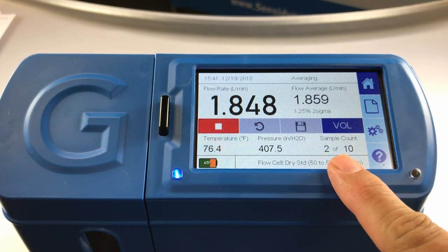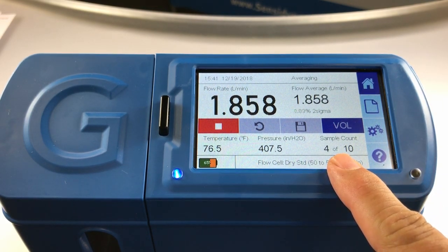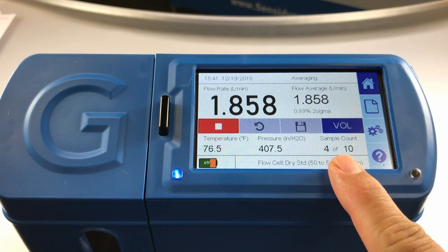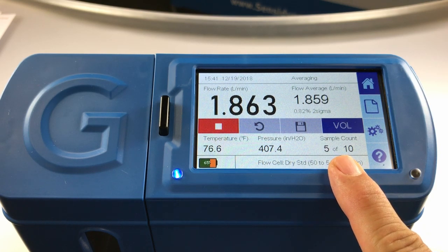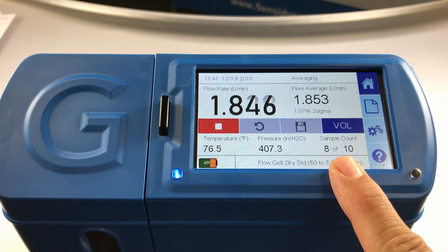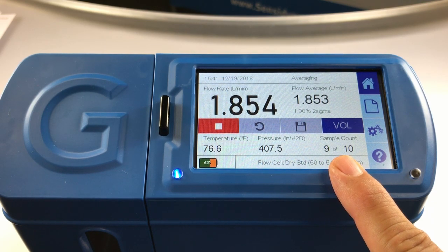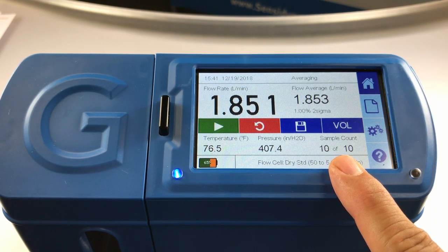You can notice that the sample count is counting up in that lower right-hand corner. It will continue to advance until it reaches 10.